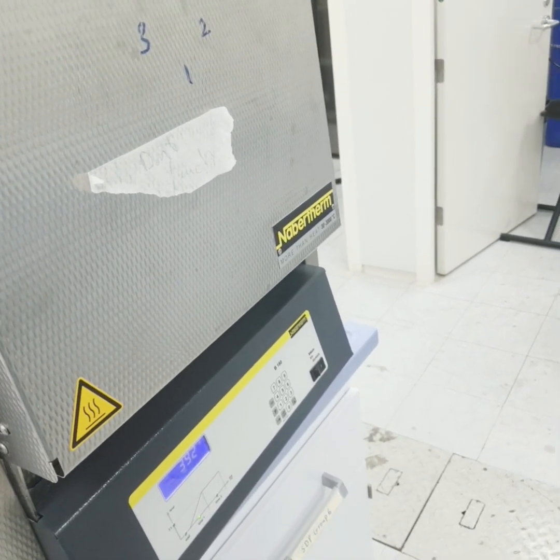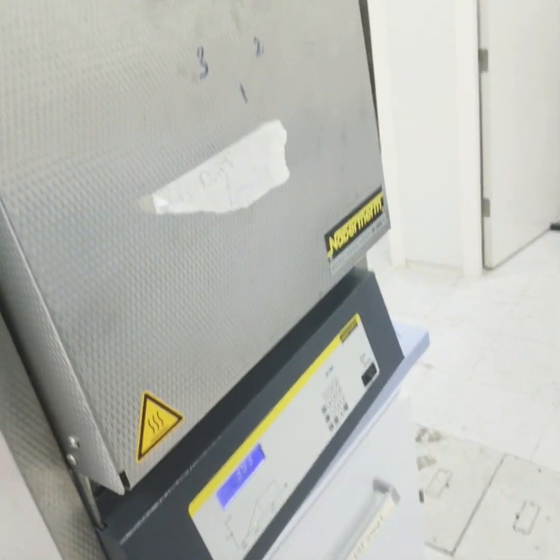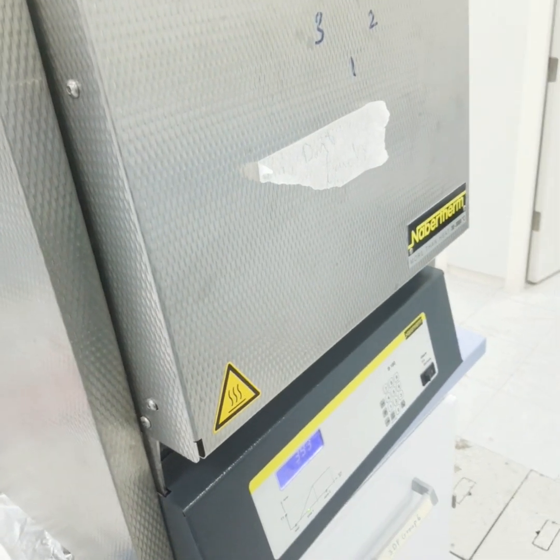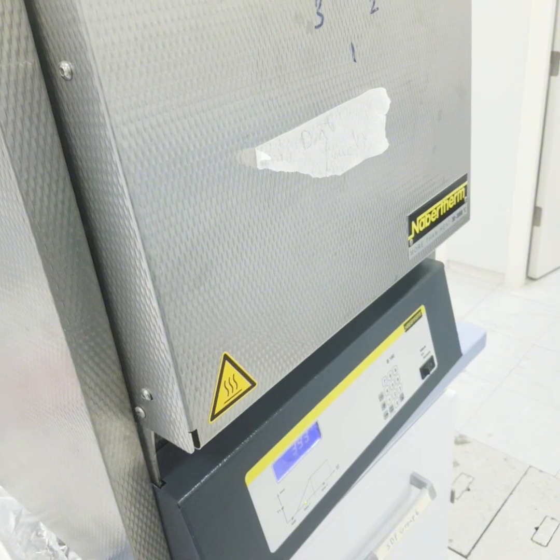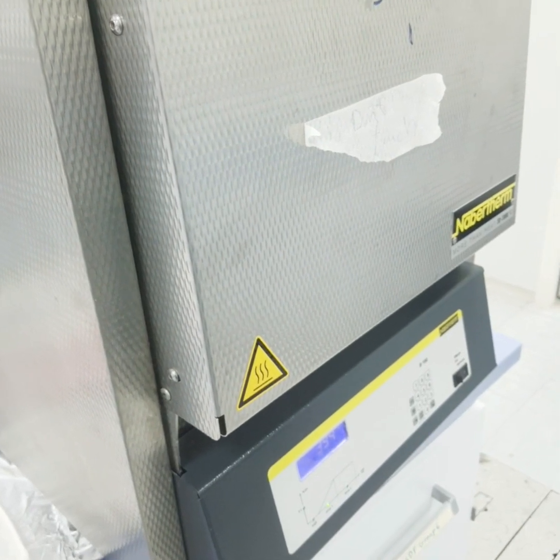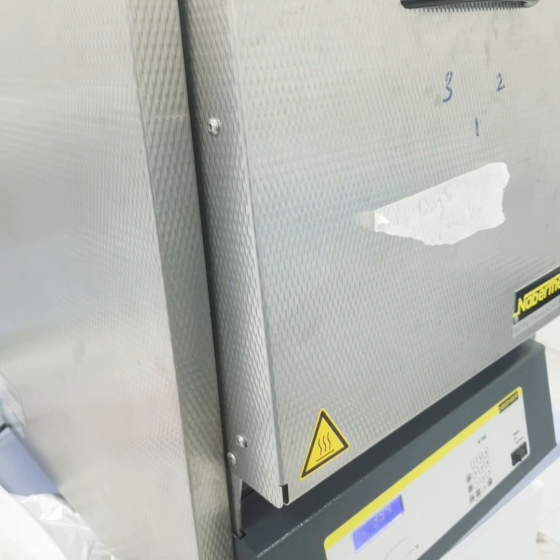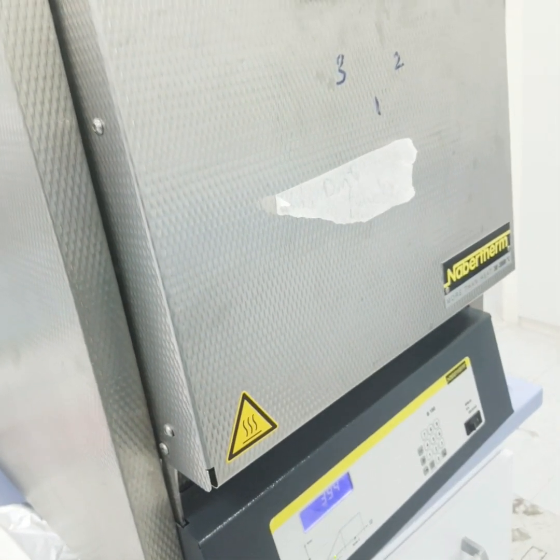The ash content is used to find out if a material is filled or not, and this will identify the total filler content. It cannot identify individual percentages in multi-fill materials without an additional test procedure being performed, and the ash content cannot be used to determine the percentage of carbon fiber or carbon black, since carbon burns off during the ash test.